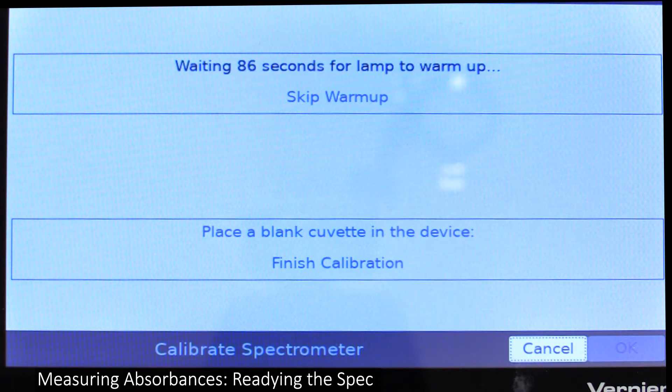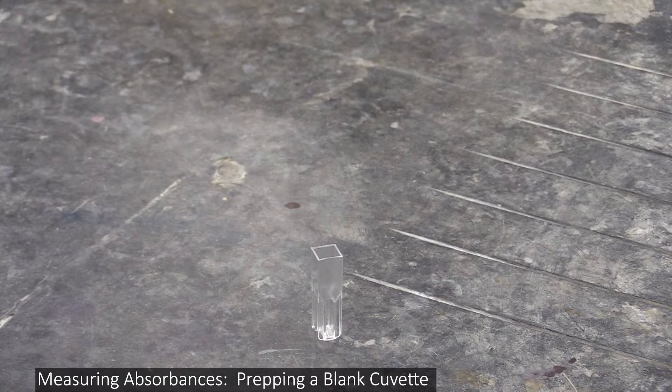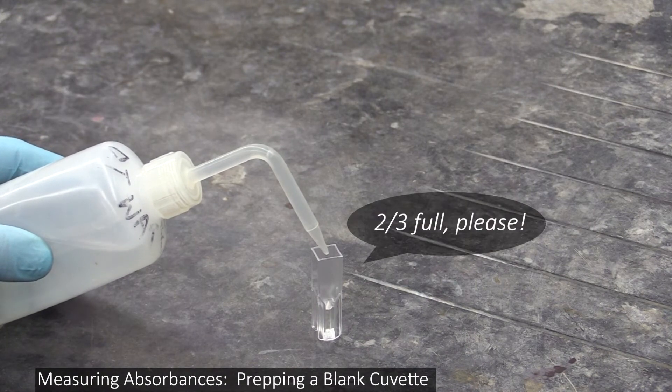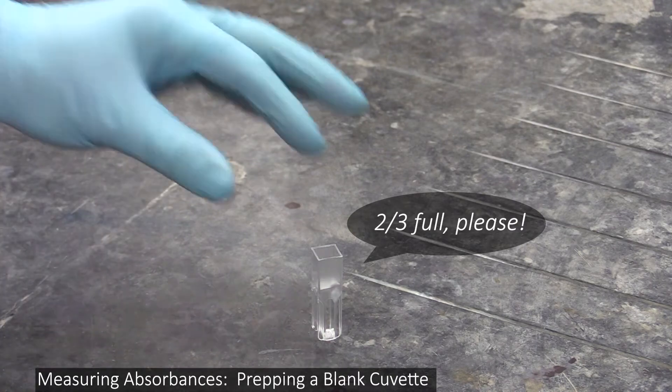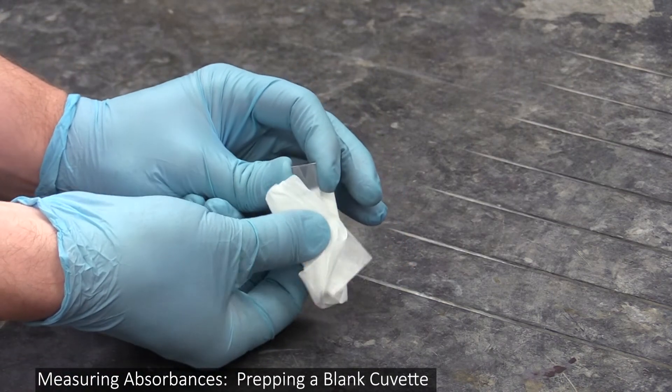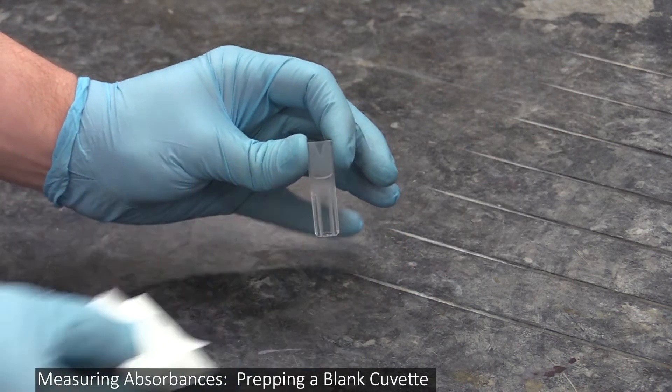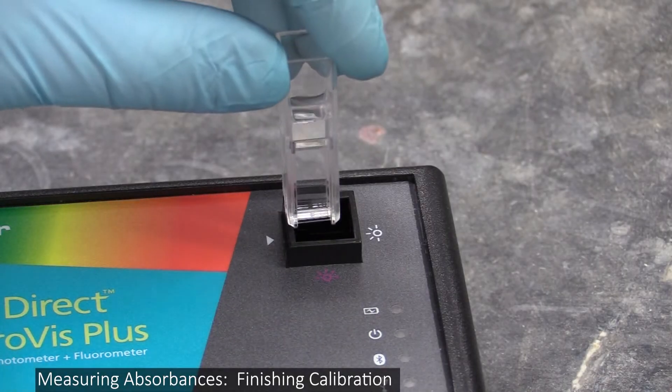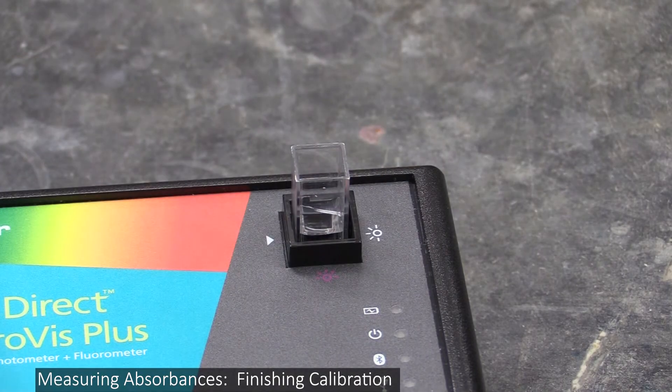While you're waiting for the countdown timer to finish, you can prepare a blank cuvette and put it in the spec. To do this, fill a cuvette about two thirds full of water, wipe its sides down with a chem wipe to make sure you get all the fingerprints and dirt and junk off it, then put it in the sample holder, making sure you have it in the right orientation.